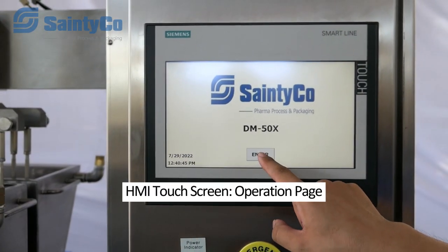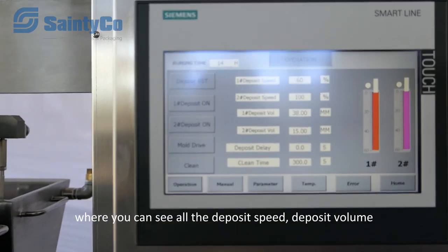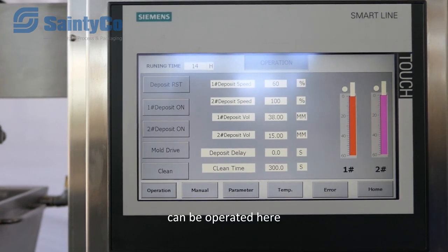Let's go to the main page. This is the main page where you can see all the deposit speed, deposit volume, and cleaning time. All the depositing instructions can be operated from here.